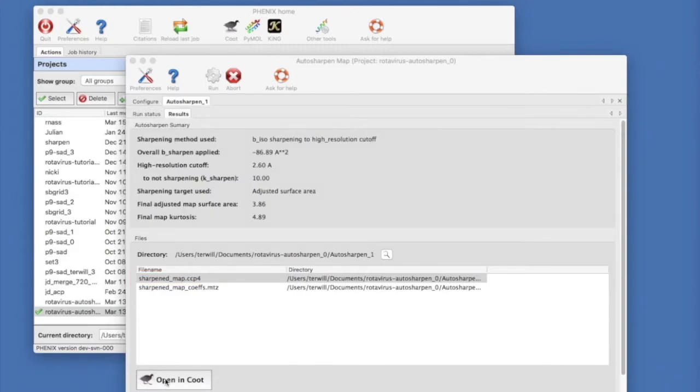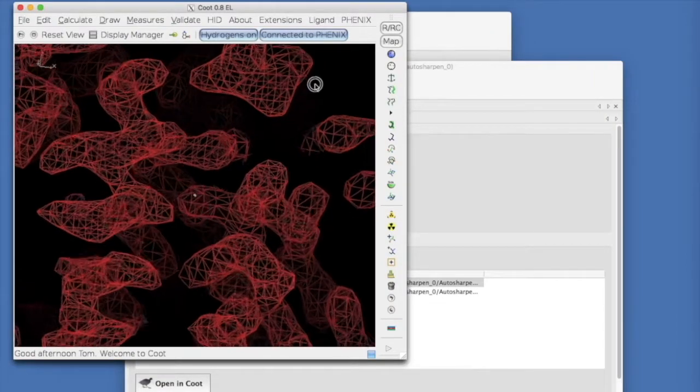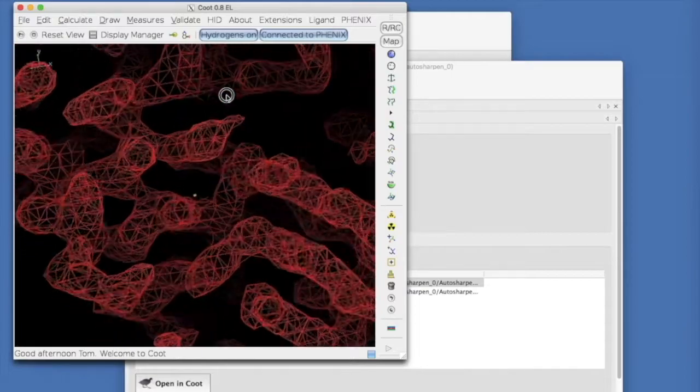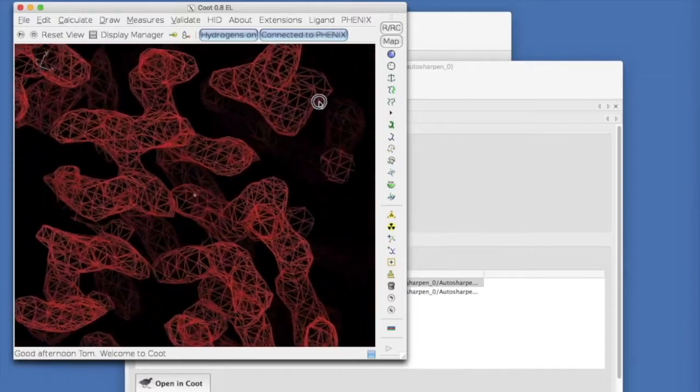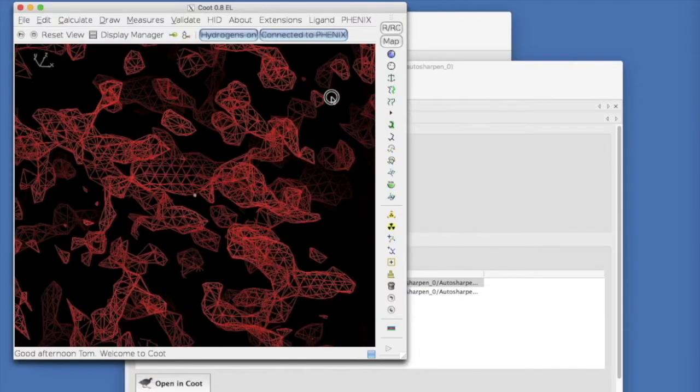If we click on the Open in Coot button, the sharpened map is displayed. The sharpened map is quite nice. It looks very little like the original over sharpened map.